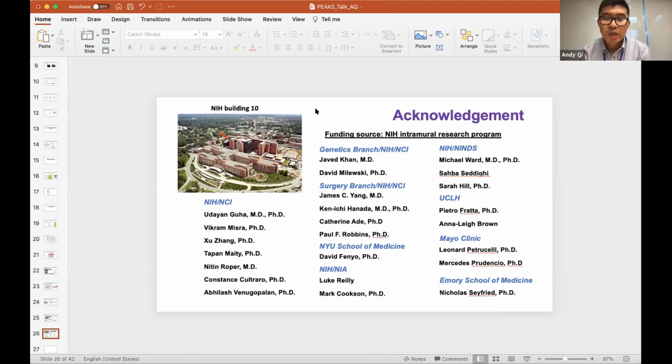So the current pipeline we developed is basically just profiling. We can provide direct evidence that the peptide exists, but we're not able to say this is actually an immunogenic peptide epitope. So there is a lot of work that needs to be done.